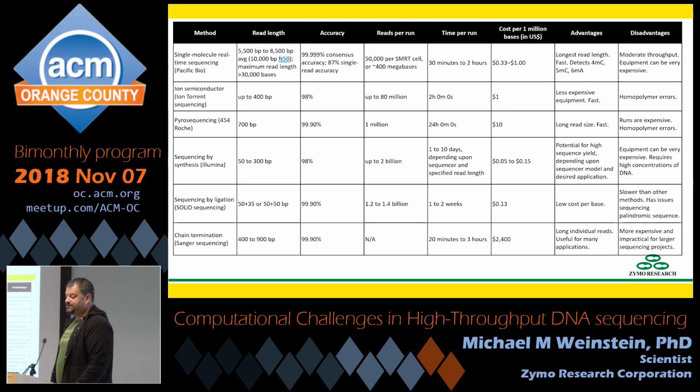There's a diversity of sequencing platforms out there. Single molecule real-time sequencing, ion semiconductor, pyrosequencing, sequencing by synthesis, sequencing by ligation, and chain termination sequencing. Pretty diverse out there. However, a couple of those platforms died, and one of those platforms isn't super relevant to us today. So two of those platforms are effectively dead. I don't really see anybody running them all that much today.